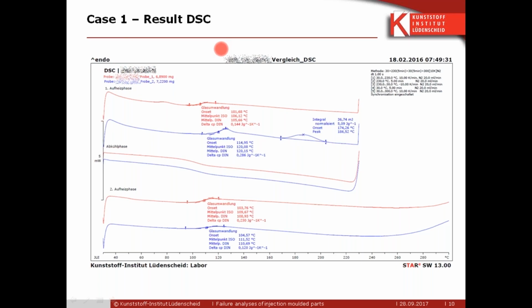So obviously here, you pick the right polymer for the right process, and obviously what they learned is if they want to produce like the competitors producing, you should use a casting polymer in a casting process. Exactly. Okay, so it's clearly so materials are somewhat different.